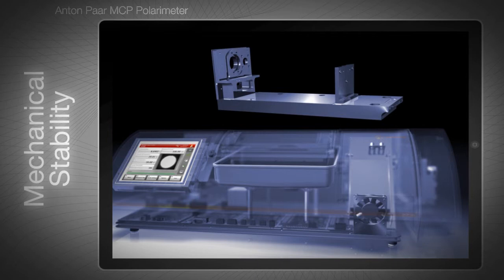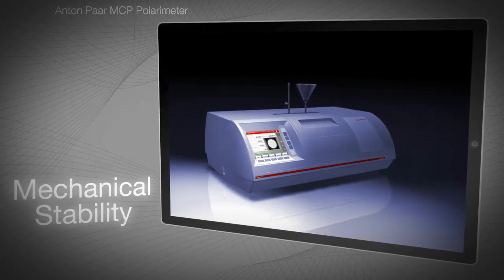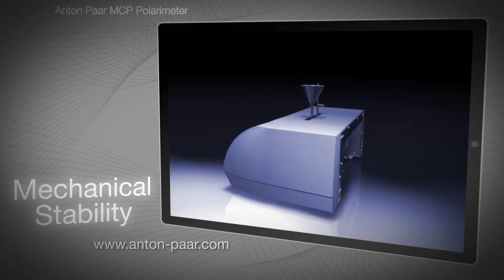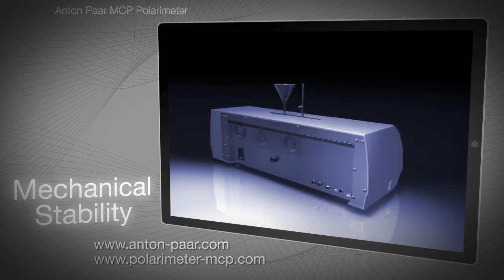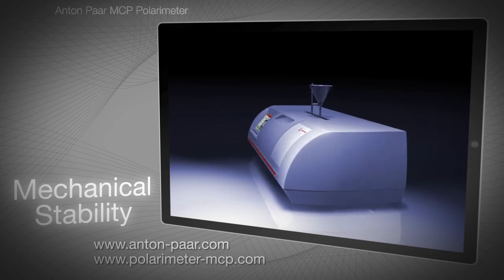You just need to unpack the polarimeter, switch it on, set zero, and fill sample. For more information on MCP polarimeters, see Anton Paar's website at anton-paar.com, or take a virtual tour at polarimeter-mcp.com. The whole MCP app, which includes this section, is available from the iTunes store.